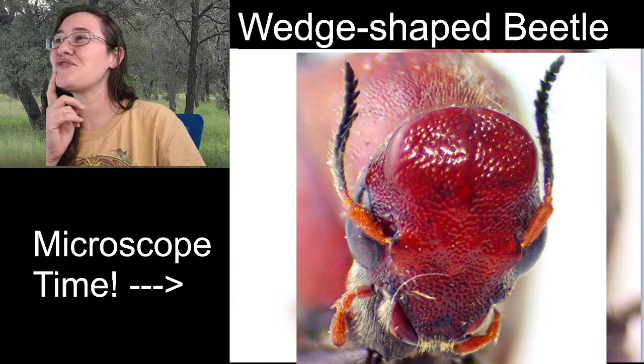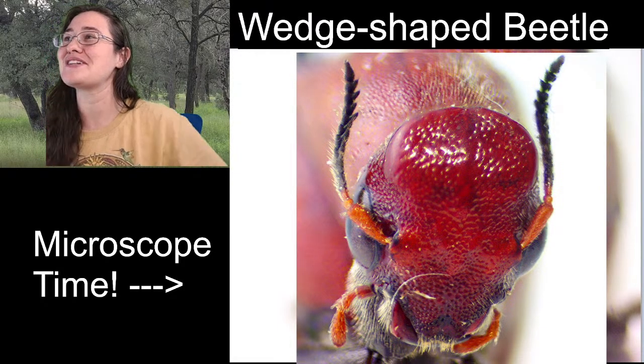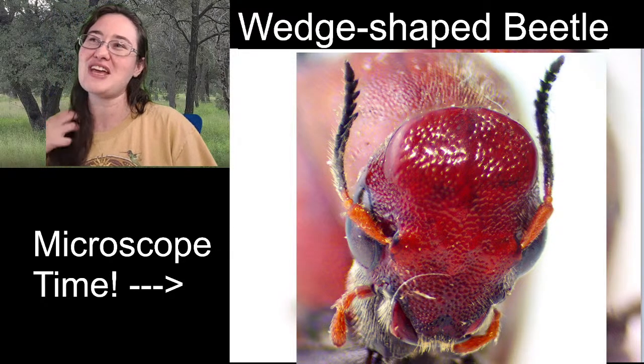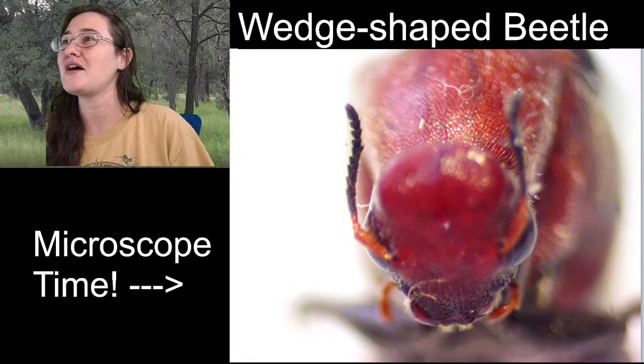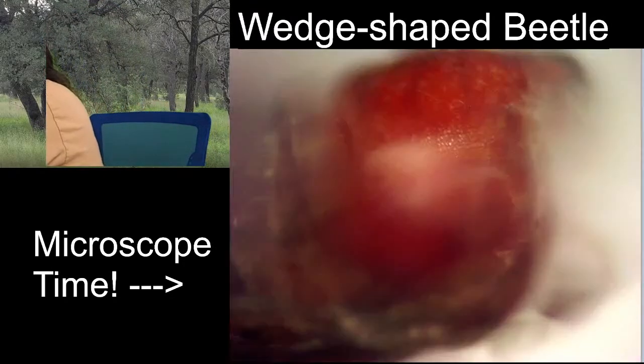Oh, that's so funny. You're right. The scape and the pedicel, they're nice and bright orange. And then the rest of it, the flagellum, you might even have the first segment of the flagellum being darkened. But that's a great observation.